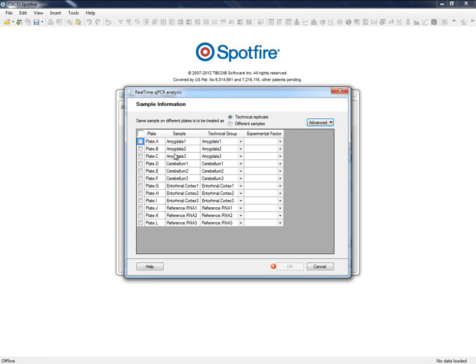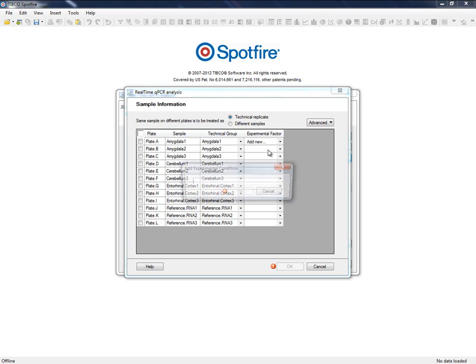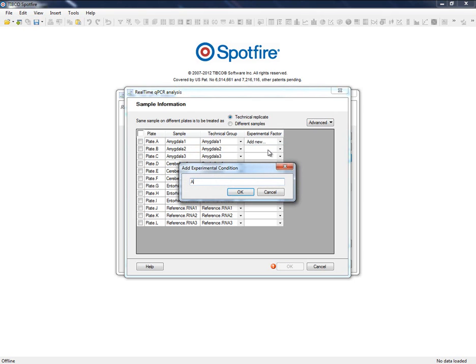We can assign, one by one, the biological group associated to each sample, but in this case, we already have an external file including such configuration.